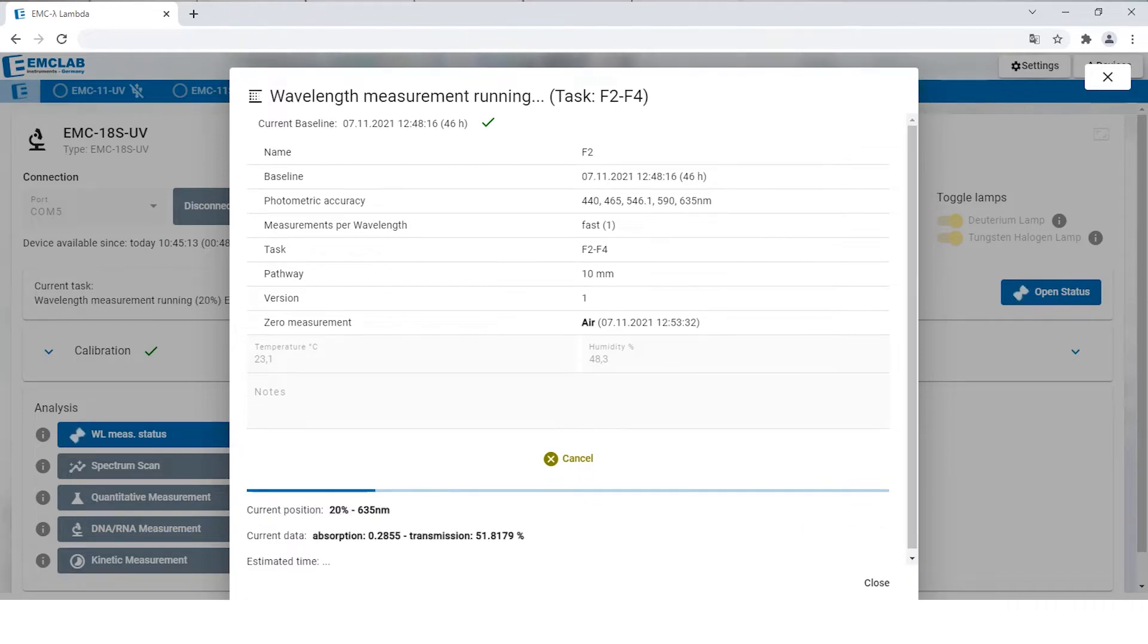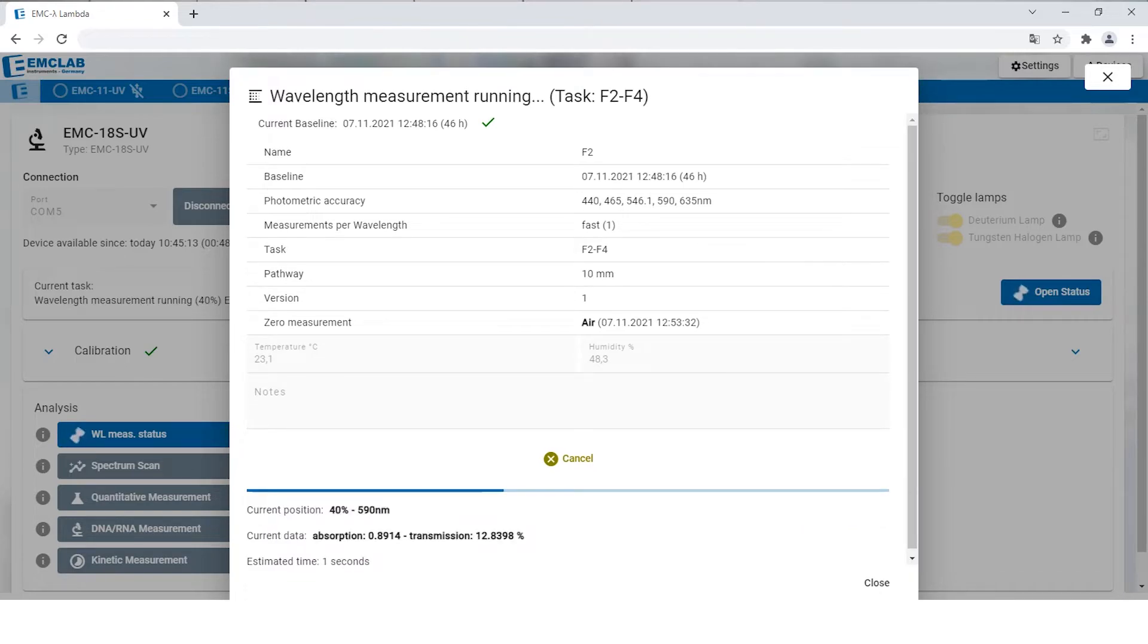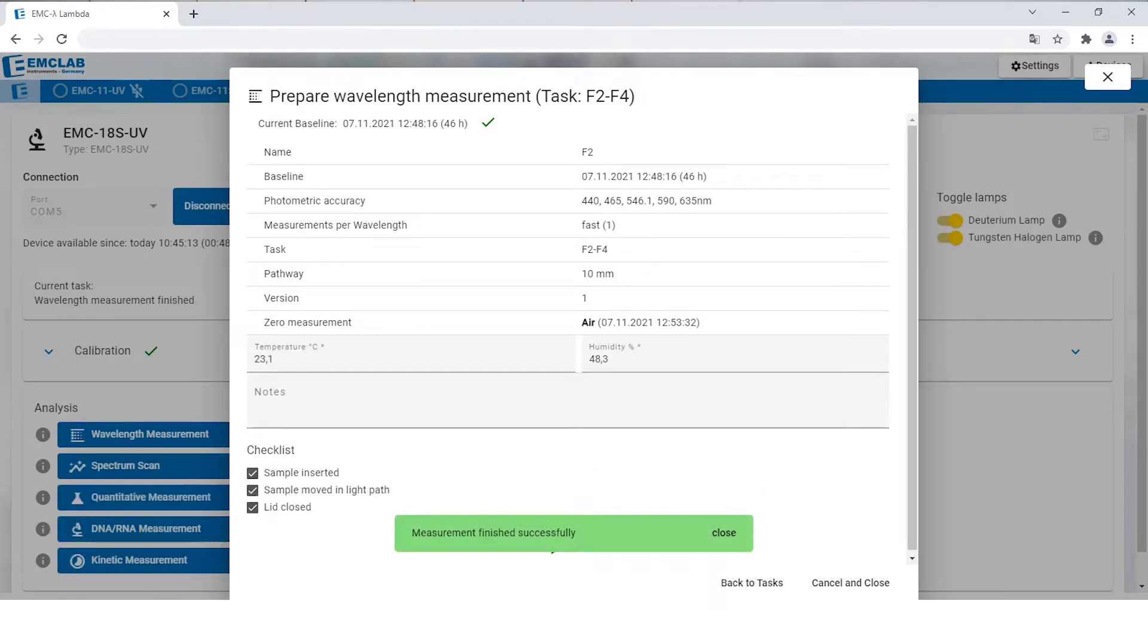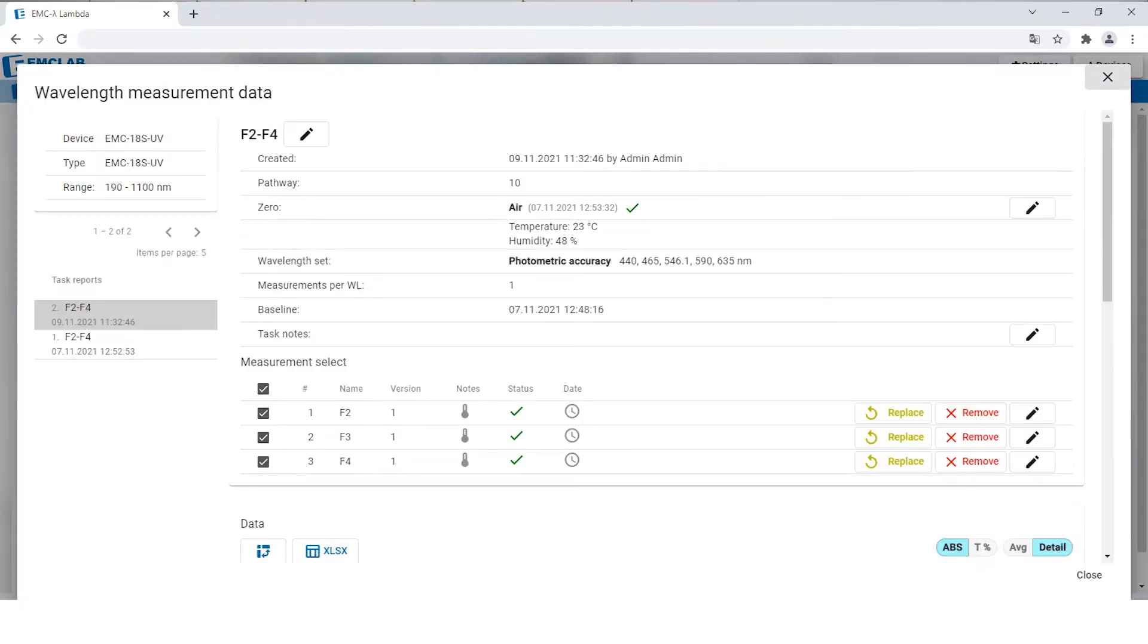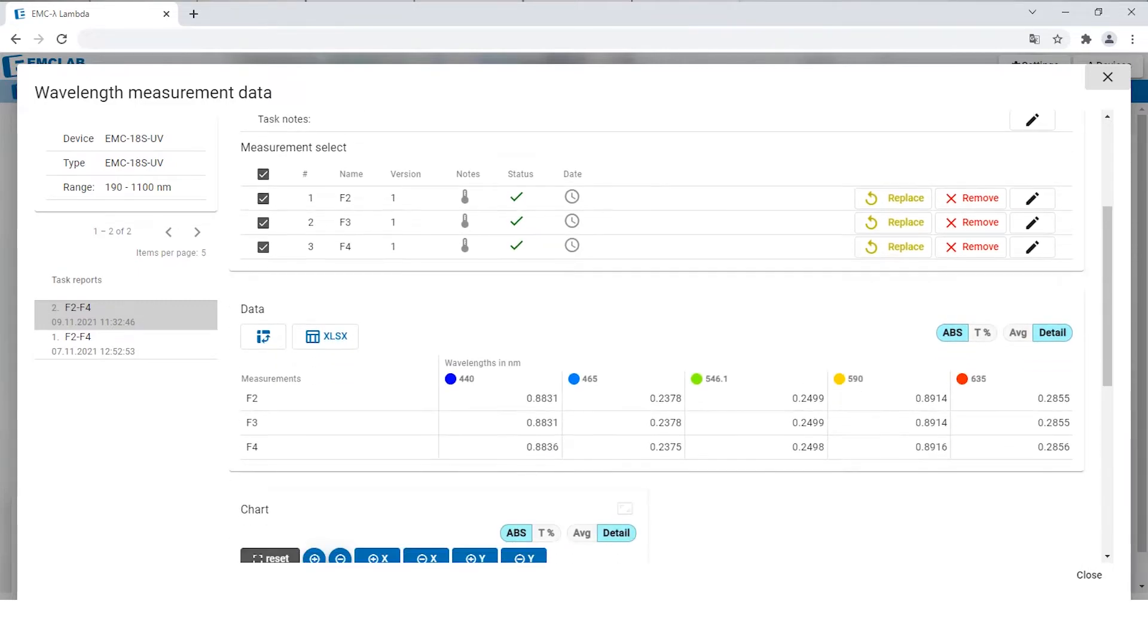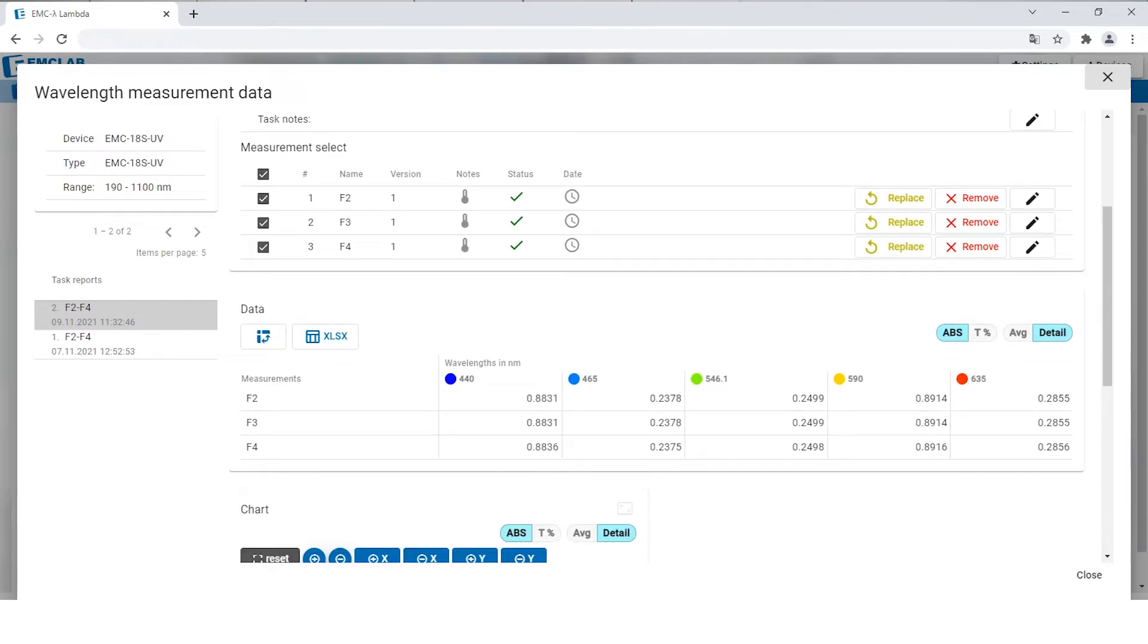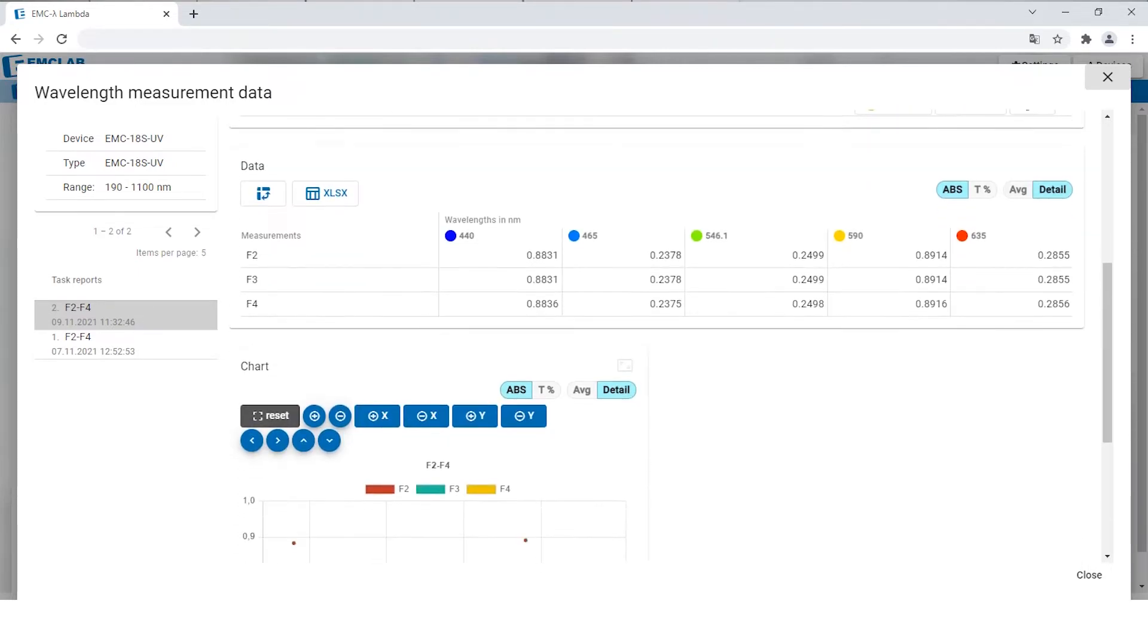Once the measurements are finished, you will be on the task screen again where you will be able to find the results under data. Here you will see the general information of the task and also a table with the results.